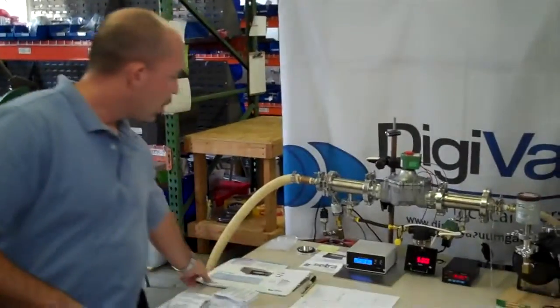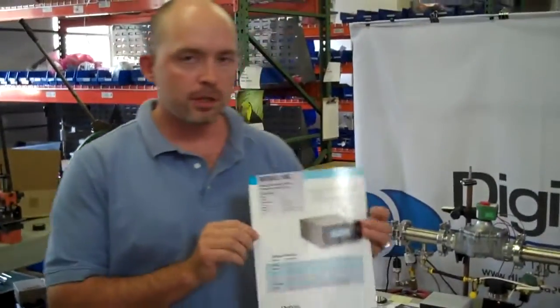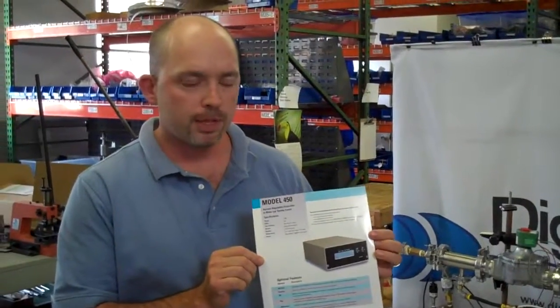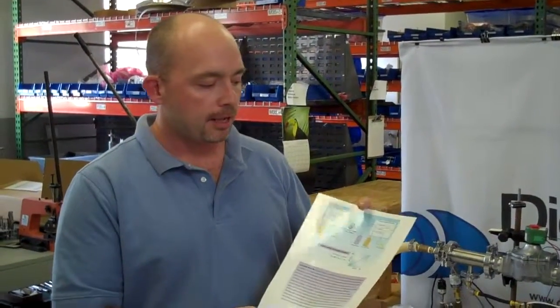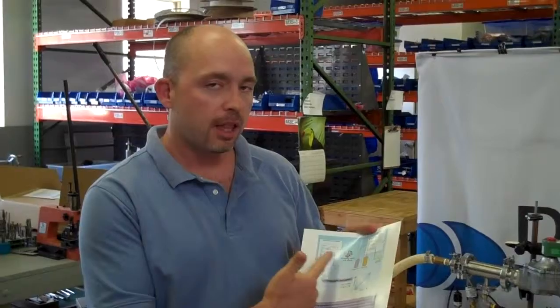We've got this great little Model 450. It actually sits in line with your vacuum pump, between your vacuum pump and your vessel, and it maintains a particular vacuum level, say at 40 torr, 50 torr, anywhere from 2 torr all the way up to 760 torr.